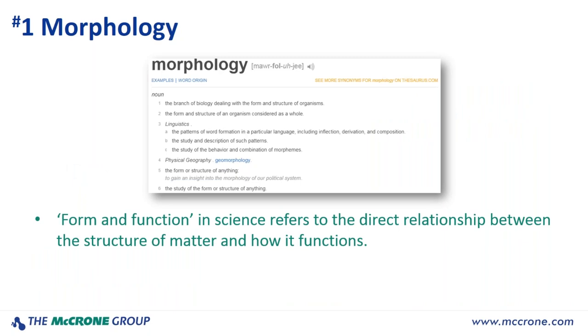Now into the five methods we're going to look at today. The morphology and size of a particle has meaningful impact on its appearance when viewed with polarizing light microscopes.